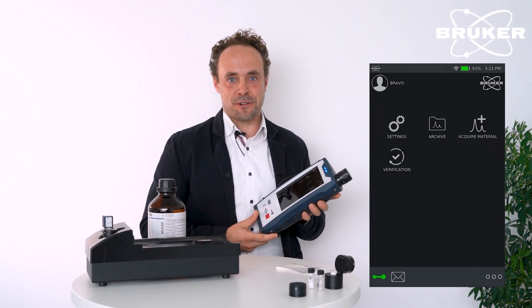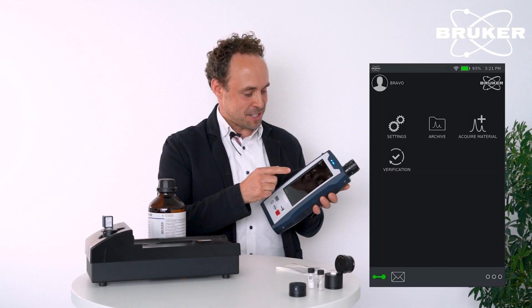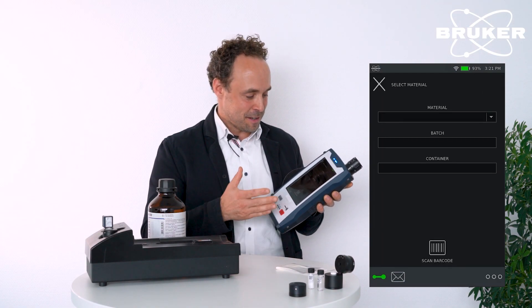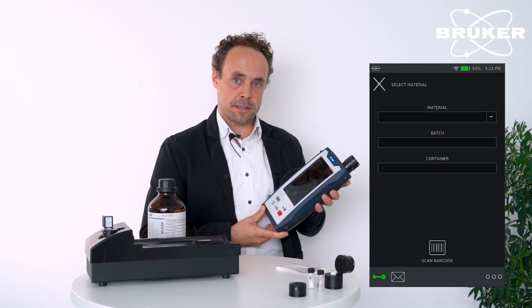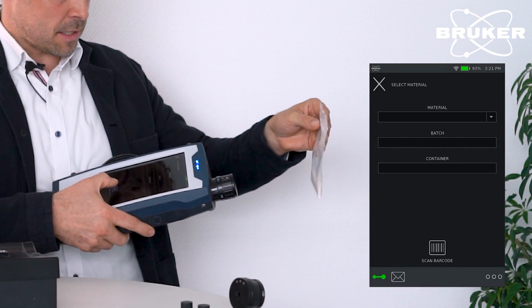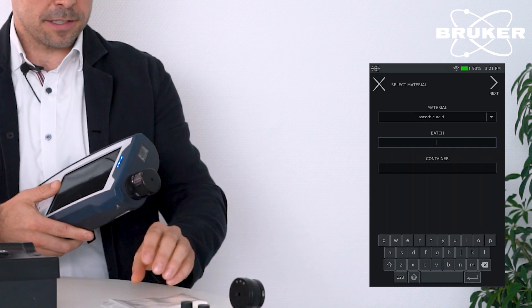To start a measurement for raw materials verification, just click on the verification icon to enter the workflow. The operator is asked to specify the material information, either using the on-screen keyboard or simply by scanning a barcode. Here it's ascorbic acid.